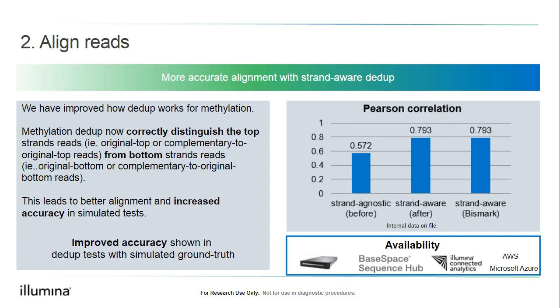Again, we have improved how we're doing the deduping. Previously we were strand agnostic, but now we are strand aware when we're doing the dedupe option. As a result of that, you can see that we are getting a better correlation, and it also matches better with what Bismark offers from a strand-aware point of view.